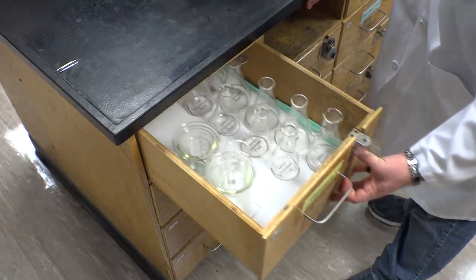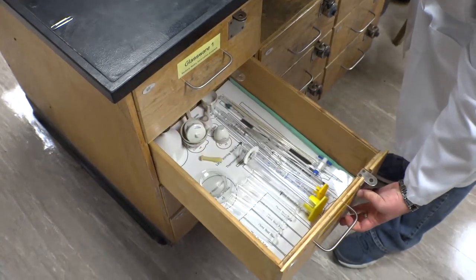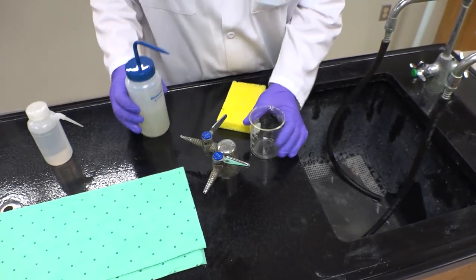Before you even look into your drawers, you see that the labels indicate that you have several different pieces of equipment at your disposal. Most of the glassware in your drawers can be cleaned with the same method, while others require special treatment. For now, let's begin with a simple 250 milliliter beaker.